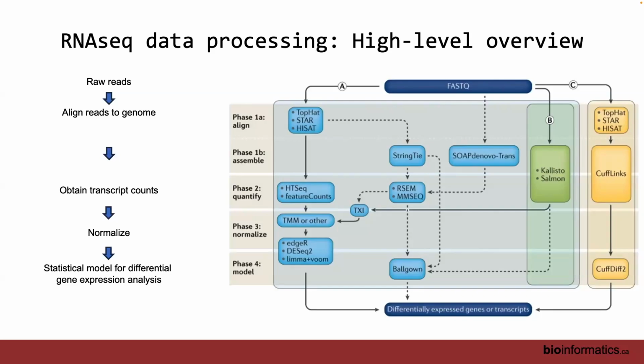It is within your own data set, but it's from sample to sample. Yeah. So if I took the same person's RNA and I sequenced it 3 different times, you'll have something called the library size, which is the total number of reads you got from that person or counts you got for that person. The same person is going to have variation just because of the way the nucleotides flowed and got sequenced and PCR and all that stuff. And so you just sort of normalize for that.